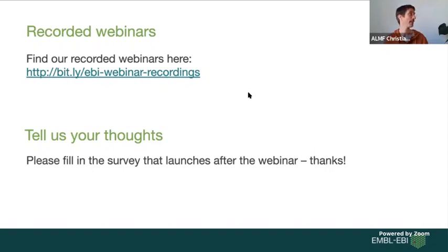If you really get more serious into it, okay, if you have electron microscopy, there is a whole thing called TrackEM in Fiji. If you really want to get into registration, I use a lot something else. It's called Elastix. This is outside of this whole, it's a different ecosystem actually, but they distribute a binary. It's fantastic. It's coming more from medical, but it's really great for registration.